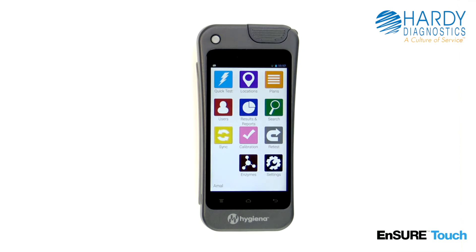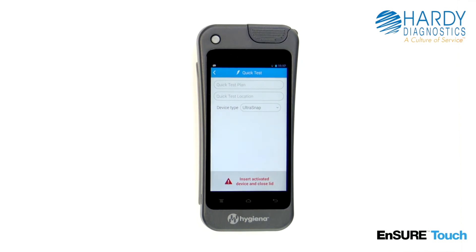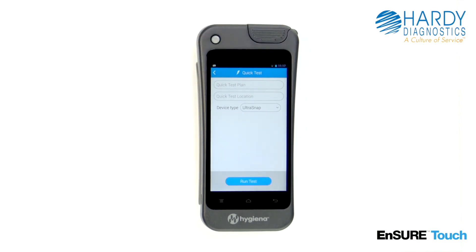To run a quick test, touch the quick test icon. Open the lid. Insert the test. Close the lid. Touch run test.